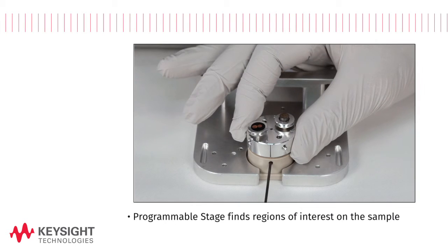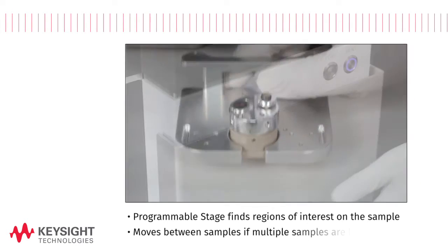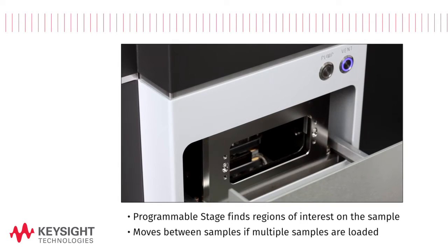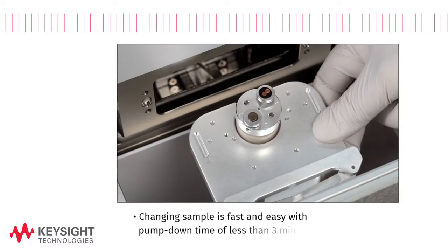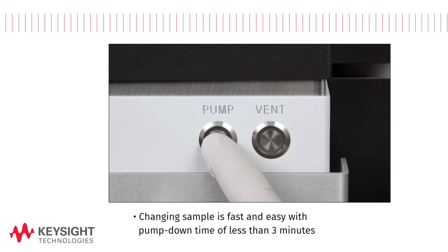A programmable stage allows you to easily find regions of interest on the sample or move between samples if multiple samples are loaded into the instrument. Changing samples is fast and easy, with pump down times of less than three minutes.